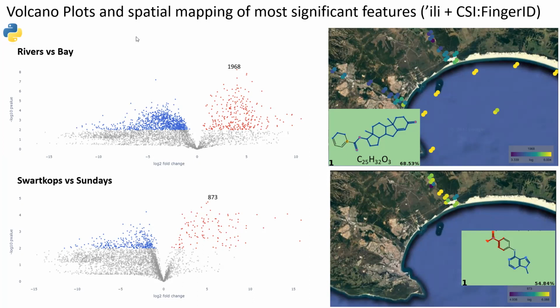We're not at this point, really. I mean, in the bay we do marine invertebrate sampling, but that would be an interesting way to look at things. I guess we'd need a very focused sampling strategy to engage with that. But what I can say about this data set is that I detected a sponge natural product in the bay, I can't remember the name, which I also found surprising to find from simple LC-MS analysis of the DOM. So I think maybe some of the marine invertebrates excrete the secondary metabolites into the environment, and thus we see them. But it's a putative annotation, so it also wasn't included in the presentation here. It could also be a wrong annotation, not verified. But I did see some features that were matched to marine natural products from marine sponges specifically.